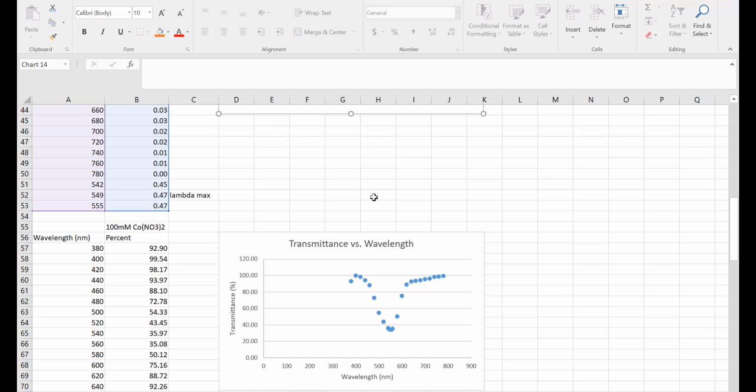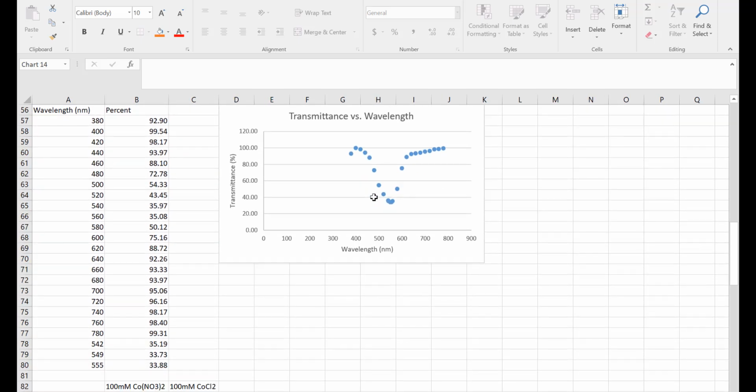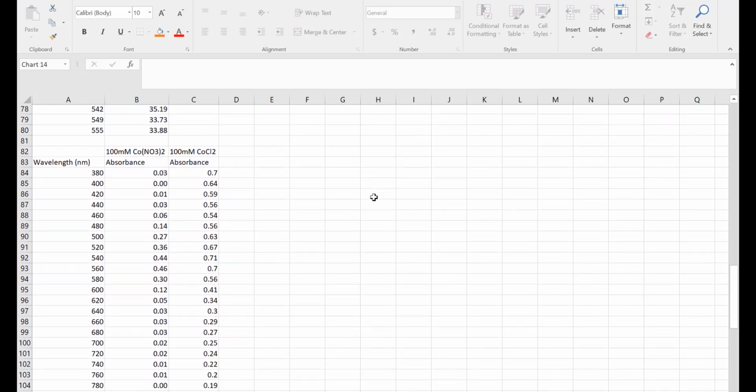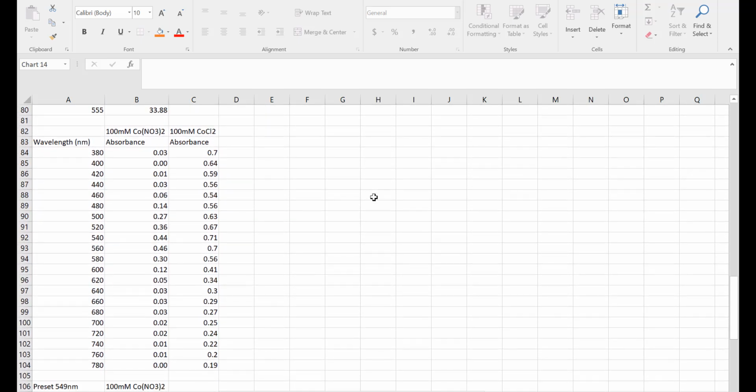Now what I'm going to do is set it at that preset wavelength and investigate how my absorbance changes. Part two is going to be how it changes via concentration, and the other is going to be with path length as well. Just before we get to those two graphs, I forgot we had one other graph.